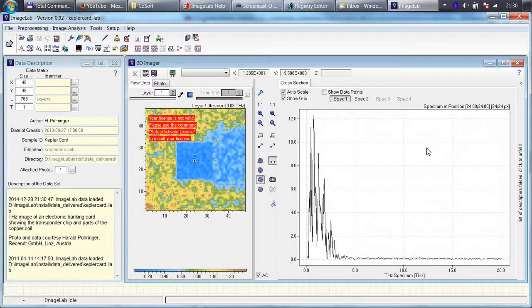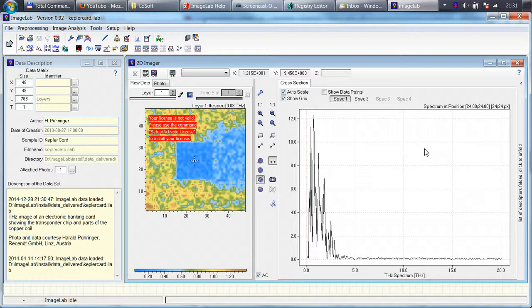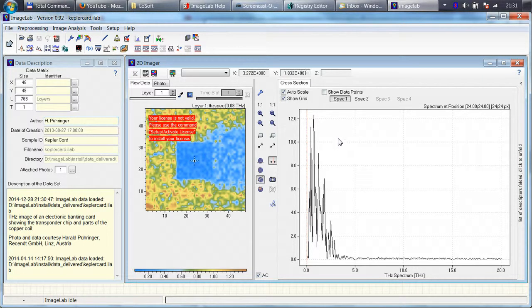This short video will show you how to install the ImageLab license. ImageLab is fully operational, even in the evaluation copy.